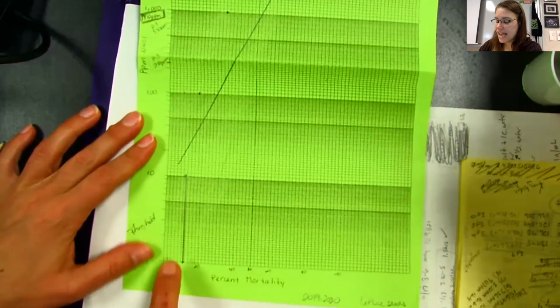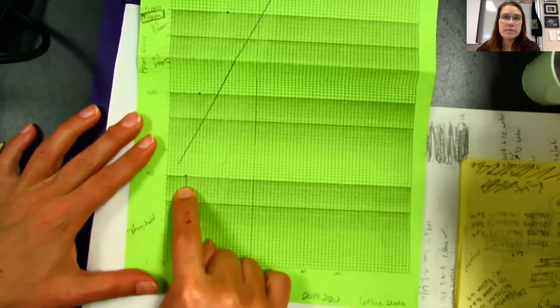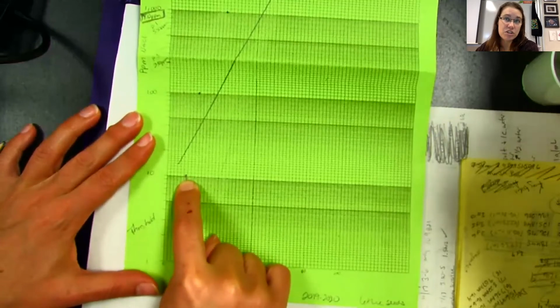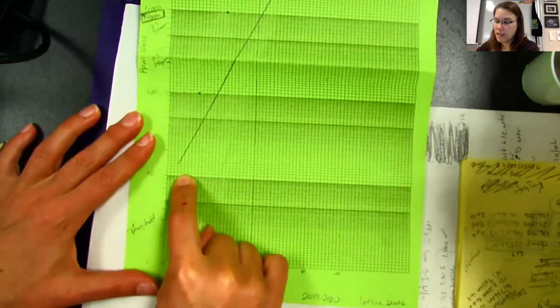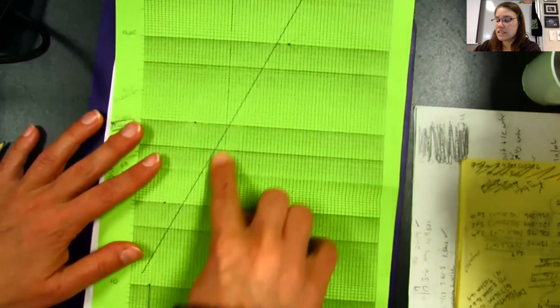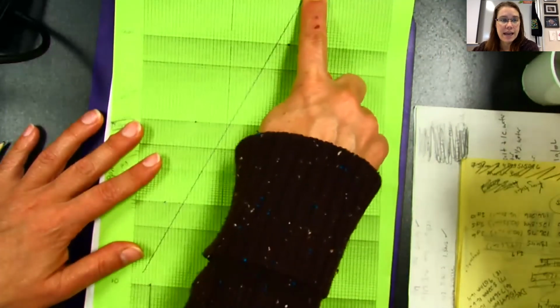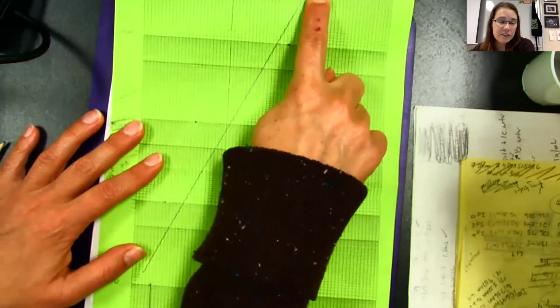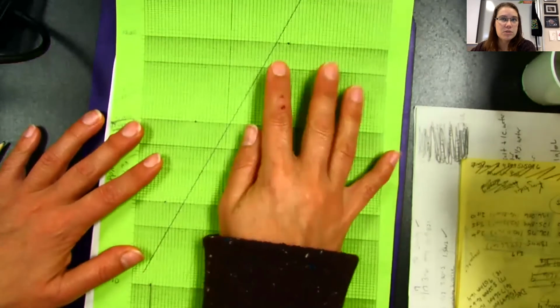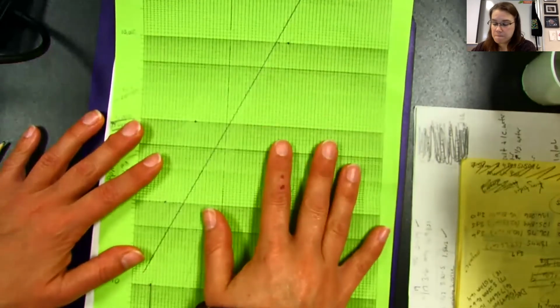From last year's data, it seemed that there was a threshold where it didn't seem to matter with the increase of concentration. There was just the same amount of mortality. But then it seemed to change, and I drew a line of best fit for all the points that I had. Now, after you get this year's data, these numbers are going to change a little bit. So I'm just showing you an example right now.